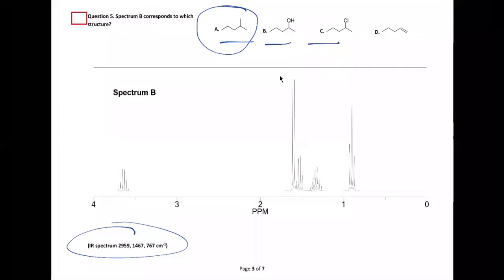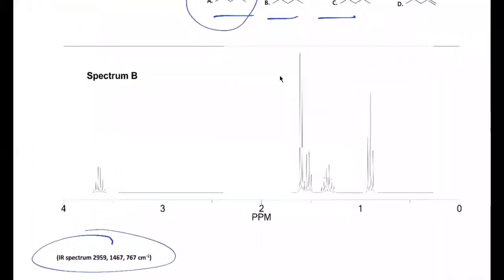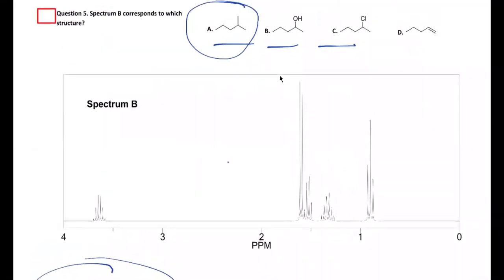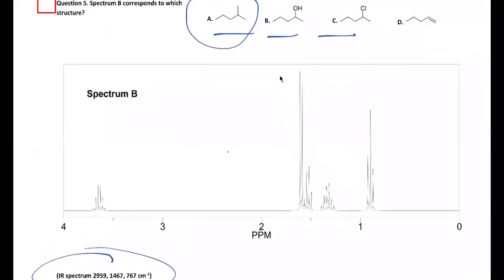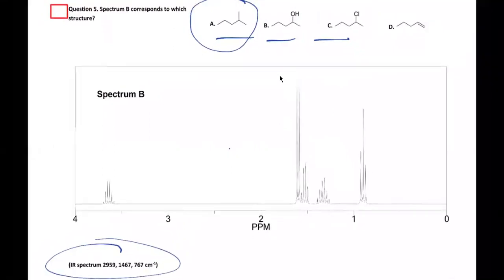So it's going to be between these two. Can somebody, let me see. The resolution is kind of bad. Can somebody tell me out of B and C, which one do you think it is and why? And it's not just based on the NMR. It's also going to be based on the infrared. If you could tell me that, I'll buy you lunch.